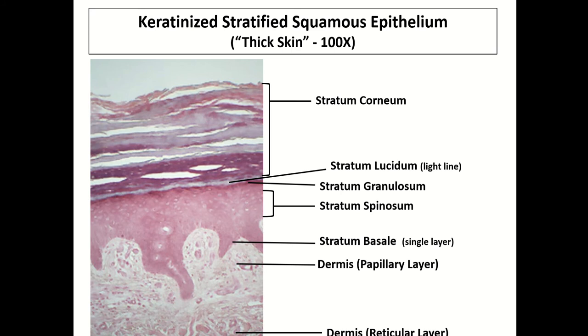Now, of course, we already looked at keratinized stratified squamous epithelium when we were discussing epithelial slides, but I wanted to bring it back up here to show you that when studying the skin, you see a location of areolar connective tissue, and that's right here in this papillary layer of the dermis. So this actually is a great location. Loose areolar connective tissue houses blood vessels, the ducts of glands. So again, really good location to note as far as where loose areolar connective tissue would be found.